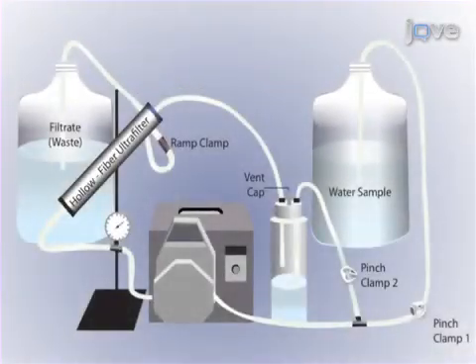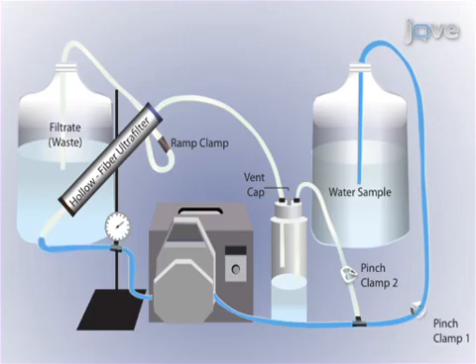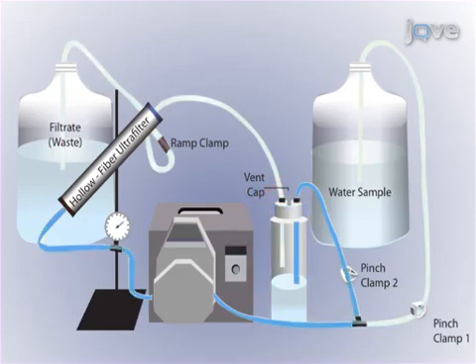The water sample enters into the system by passing through the black T connector and moves through the pump head, the pressure gauge, and into the hollow fiber ultrafilter. The filtered water passes out of the side of the filter into the waste container. The retained water containing the organisms is forced into the retentate bottle and recirculated through the system until the volume of water is reduced.